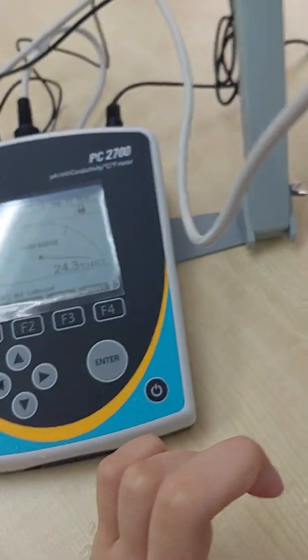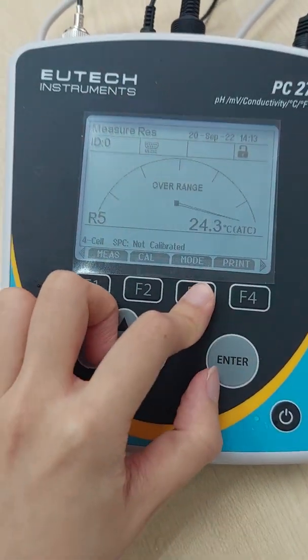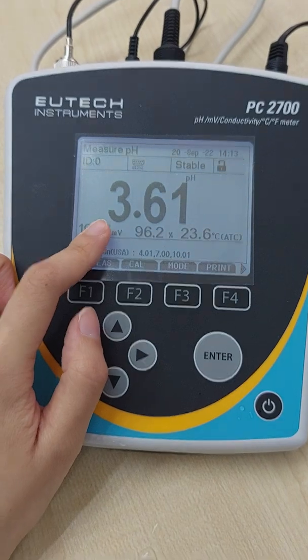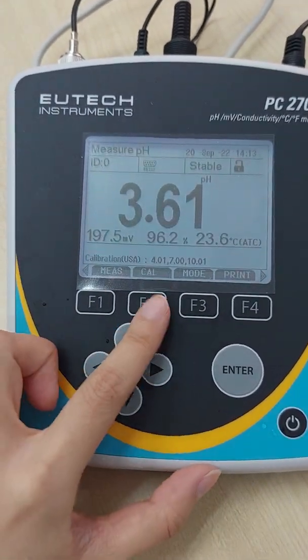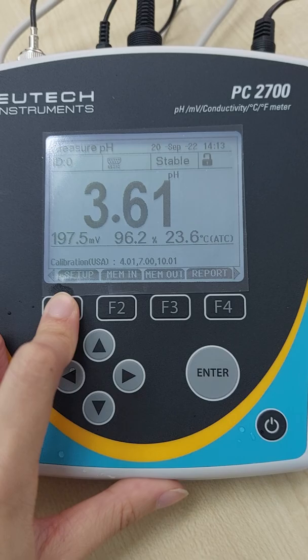Resistivity also uses the same probe. It is the opposite of conductivity. And then back to pH. Now we'll go to the setting, setup.